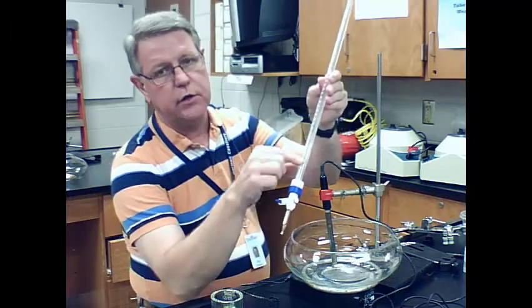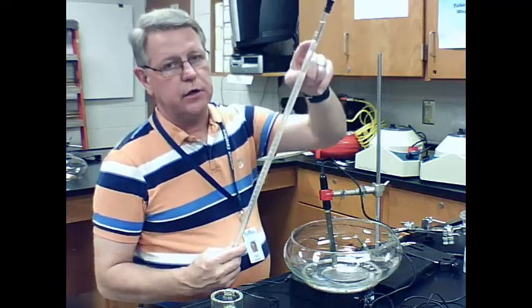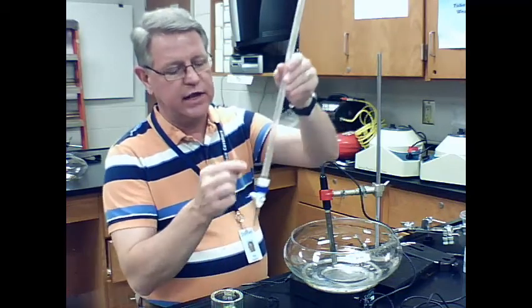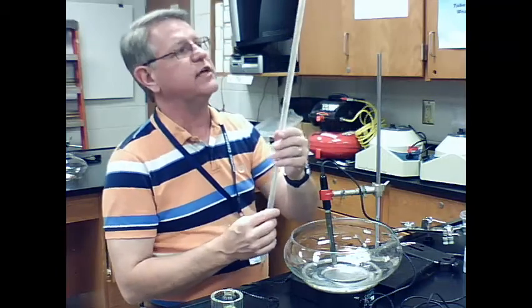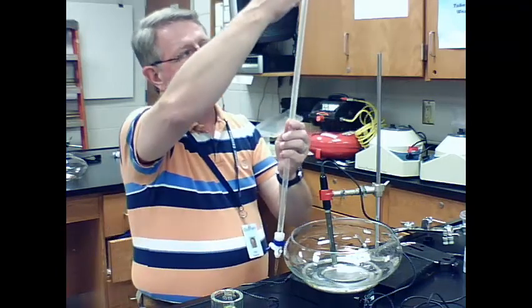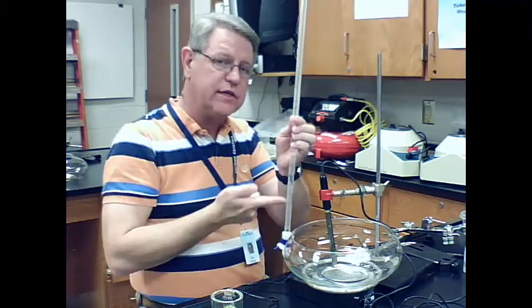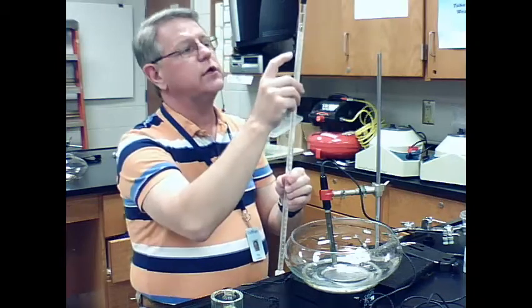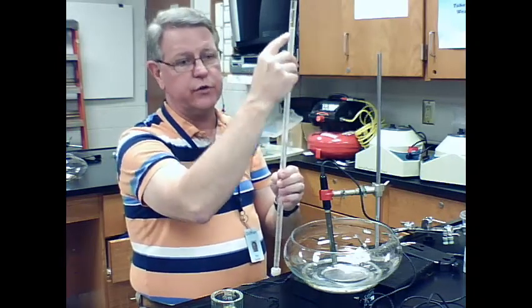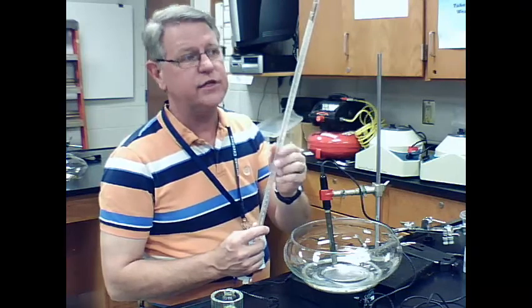So you can allow the drop counter just to drop, drop, drop, drop, drop through there to get your pH curve, or you can use a burette. The burette actually measures out the volume that you're using. Now, burettes are designed so that this number at the top is zero, and what's at the bottom is 50. Sometimes it has different measurement units, but that's what this one has. And so what this is designed to do is to measure the amount of liquid that comes out, not the amount of liquid that is inside the burette. And you have to make sure that you're measuring the correct number of significant digits.